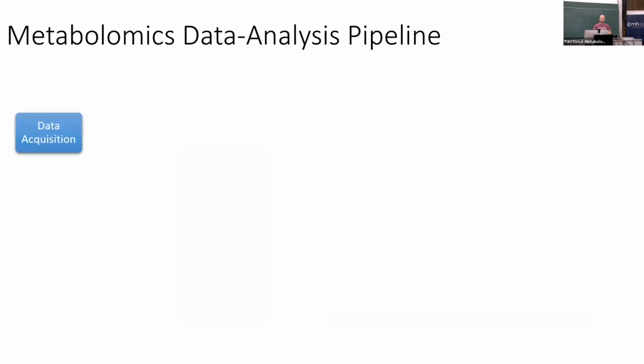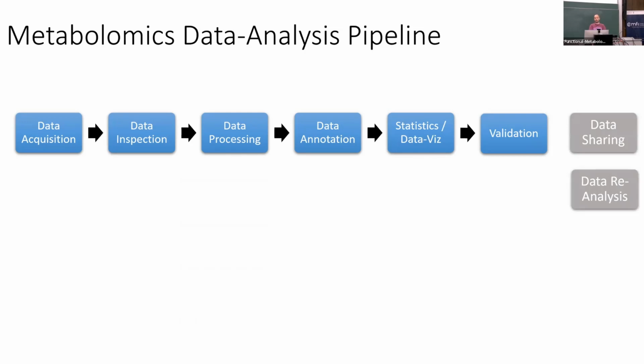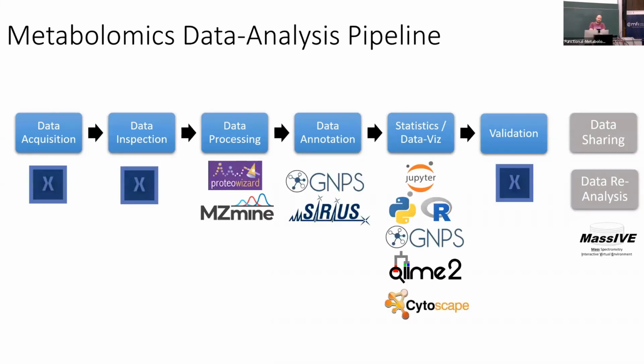Okay, so now coming back to our pipeline, that guided us through the week. We started with data acquisition, some data inspection, processing, annotation, statistics, and validation, as well as hopefully data sharing and reanalysis, as Ming nicely highlighted yesterday. And we presented you a couple of tools. Again, this is just what we use. There are many other tools and many other combinations, but typically it's a complex environment.